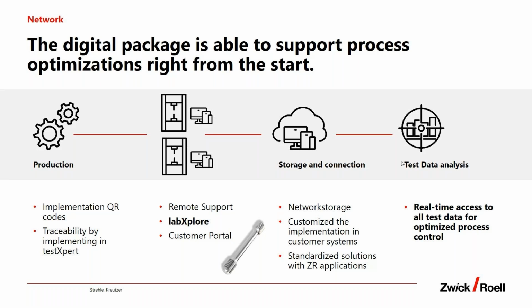The customer portal was mentioned, where you have access to your calibration reports, for example, and your service reports, but you also have the possibility to download testXpert at any time if you need to set up a new computer, or you want to go for an update or upgrade of your system. You can easily access this data. And please keep in mind that the digital package, especially for testXpert, the newest version, is free for one year.